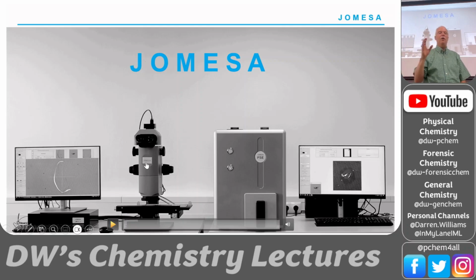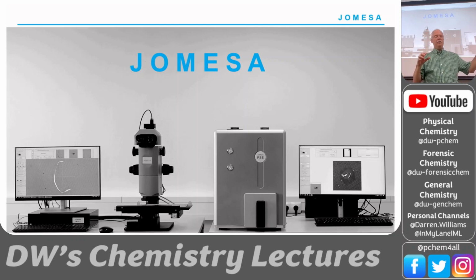This is made for automotive particles, and so they're looking at particles that they wash off the parts. So let's say they make fuel lines, and you don't want any particles in the fuel line because you don't want those abrasive particles getting into your fuel injectors. They'll clog your fuel injectors. So they have really stringent requirements on particles in fuel line systems and certain automotive components, because one 200 micron particle can clog a fuel injector and you're done. So they have no particles above a certain range, a few particles to pass the test, maybe 5 or fewer particles in the 100 micron or less range, and so on. So they have really stringent requirements.